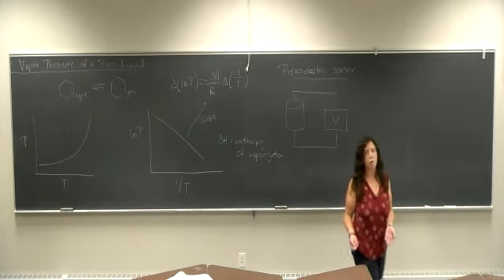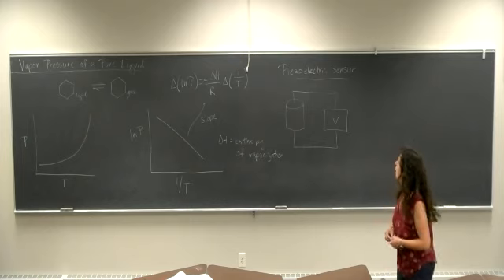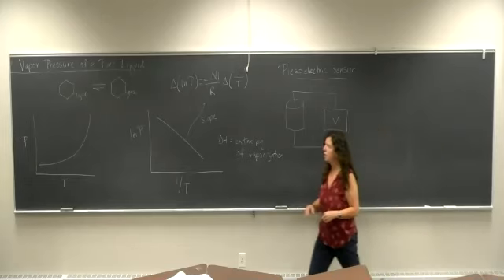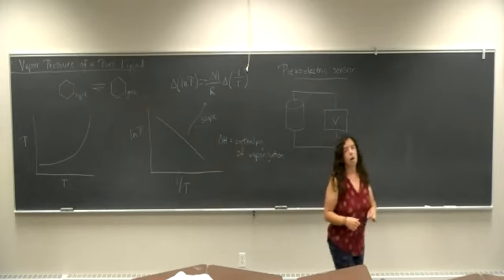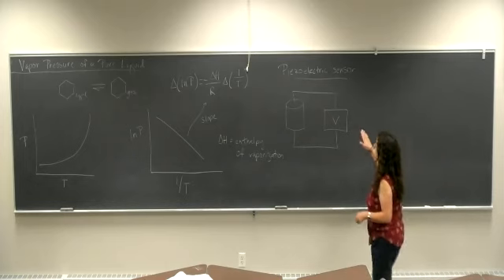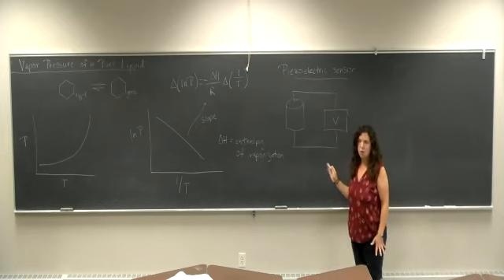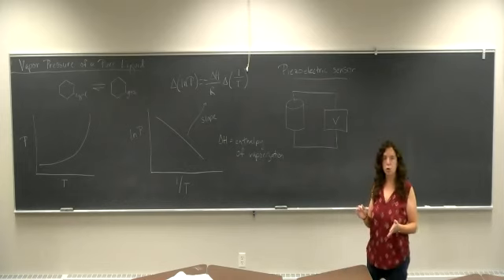The data will be provided for you, but it was collected in the lab using an apparatus that has a piezoelectric sensor. So the cyclohexane will be contained in a vessel, and then at atmospheric pressure, we can set our sensor to a certain voltage. The piezoelectric sensor works by producing an electrical response when there's some mechanical stress.